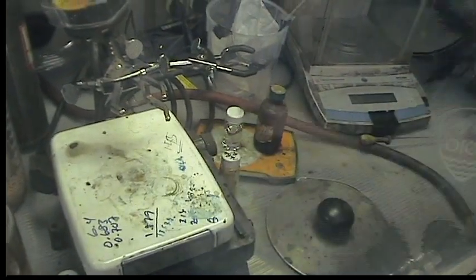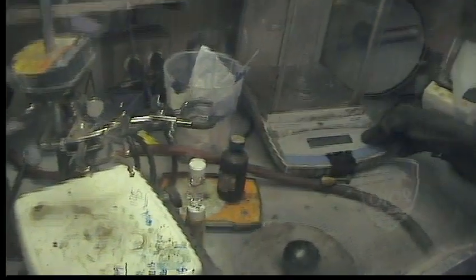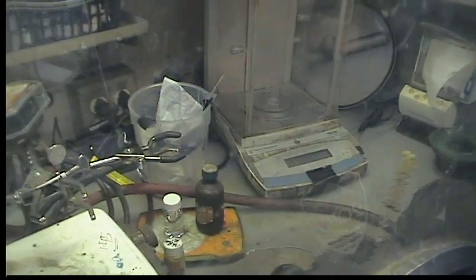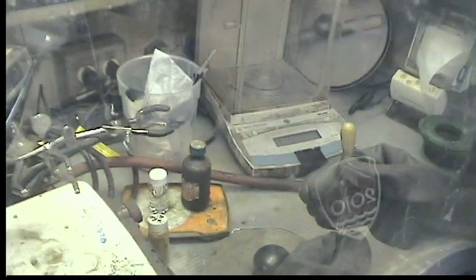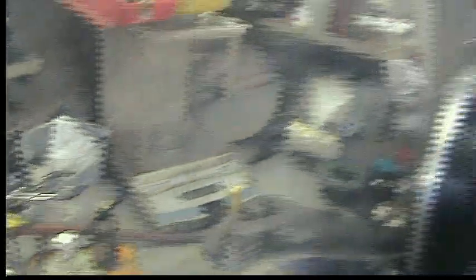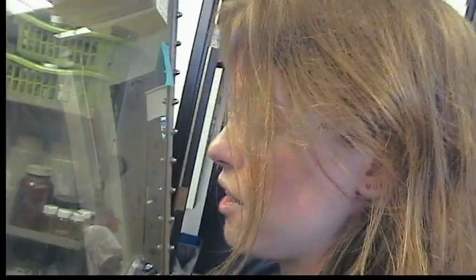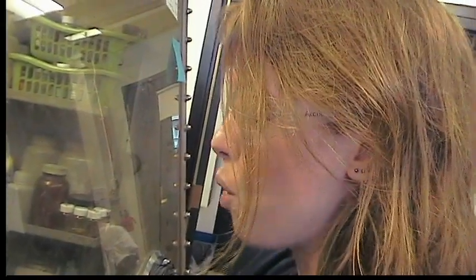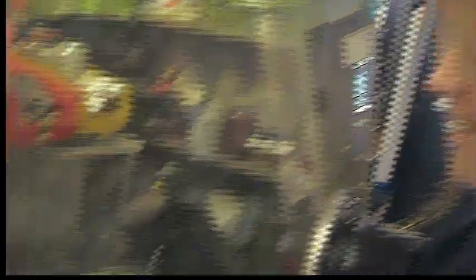And then we'll weigh out the arsenic trichloride. Arsenic trichloride is quite toxic, so you definitely want to handle it in a glove box if possible. You want to dispose of all the glass waste that has touched it very carefully — set aside your pipettes and your vials and dispose of them properly.